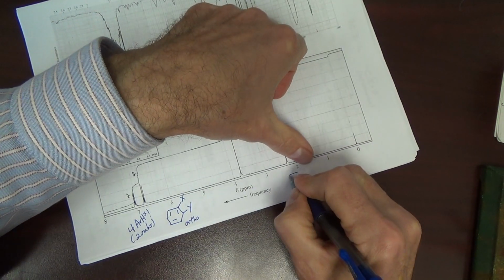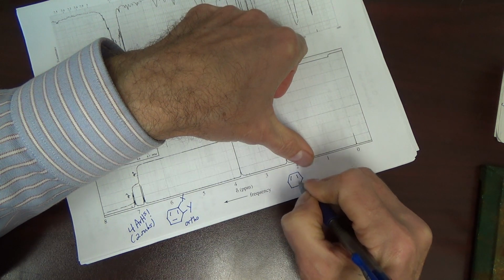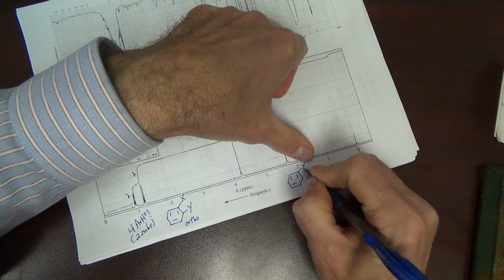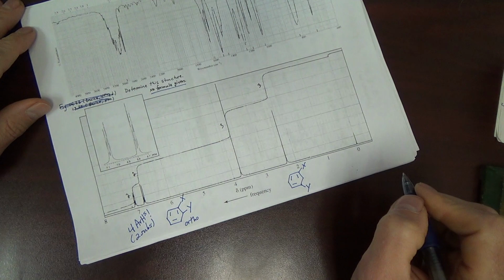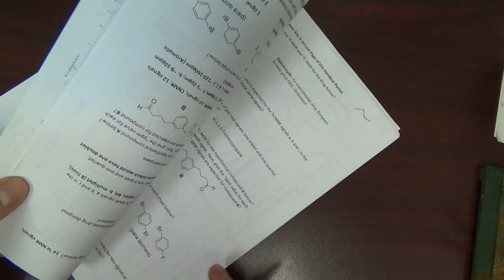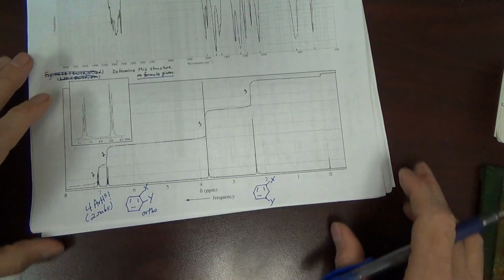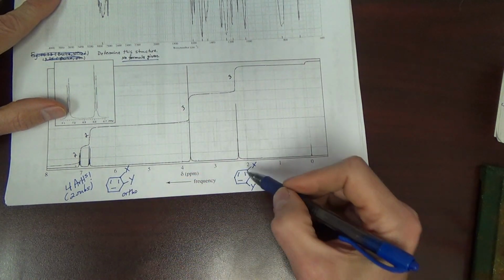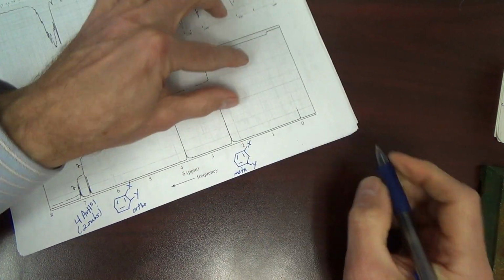We could also have these substituents, that's a 1-2 relationship. Here it could be a 1-3 relationship. This is called meta, a meta relationship.